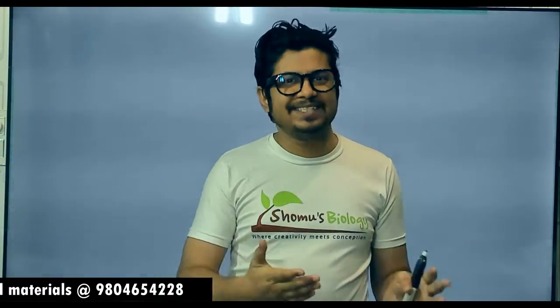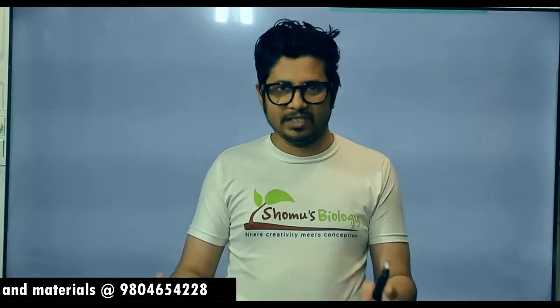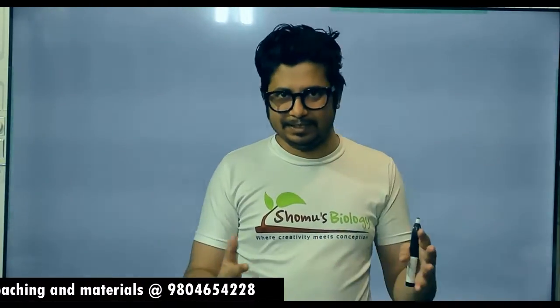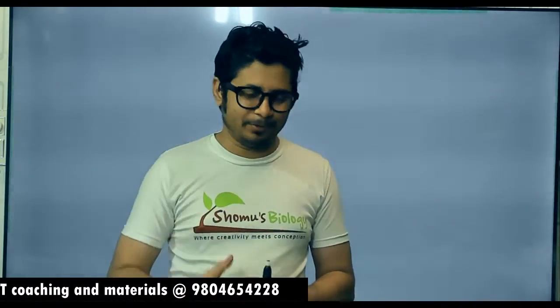We'll also talk about SDS-PAGE. We'll also talk about pulsed field gel electrophoresis. We'll also talk about capillary gel electrophoresis in this series of videos, okay? So continue to watch them.